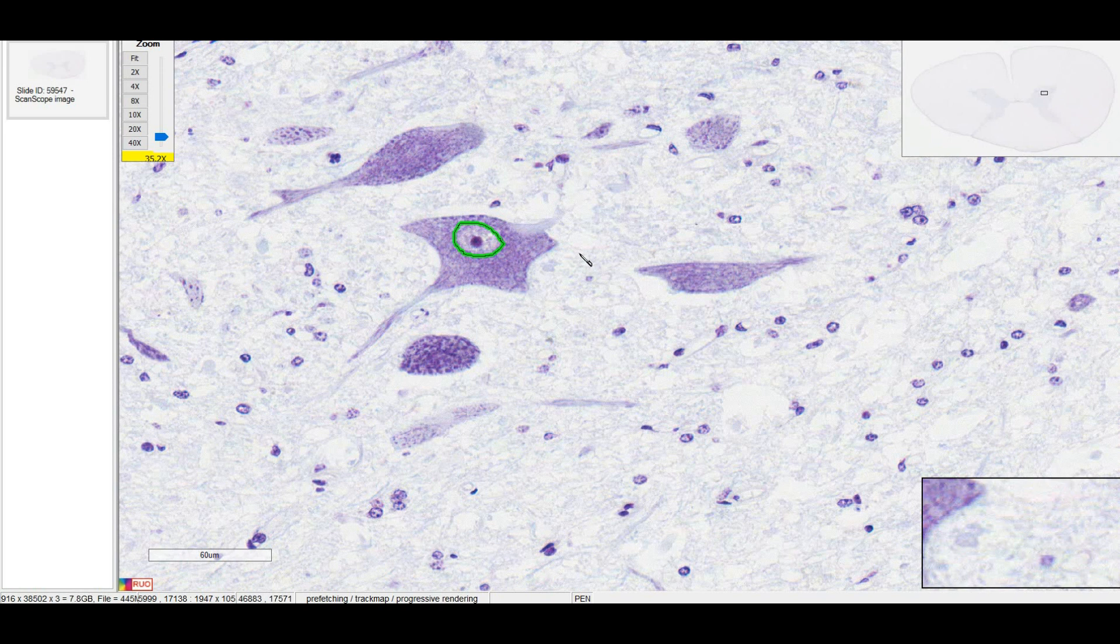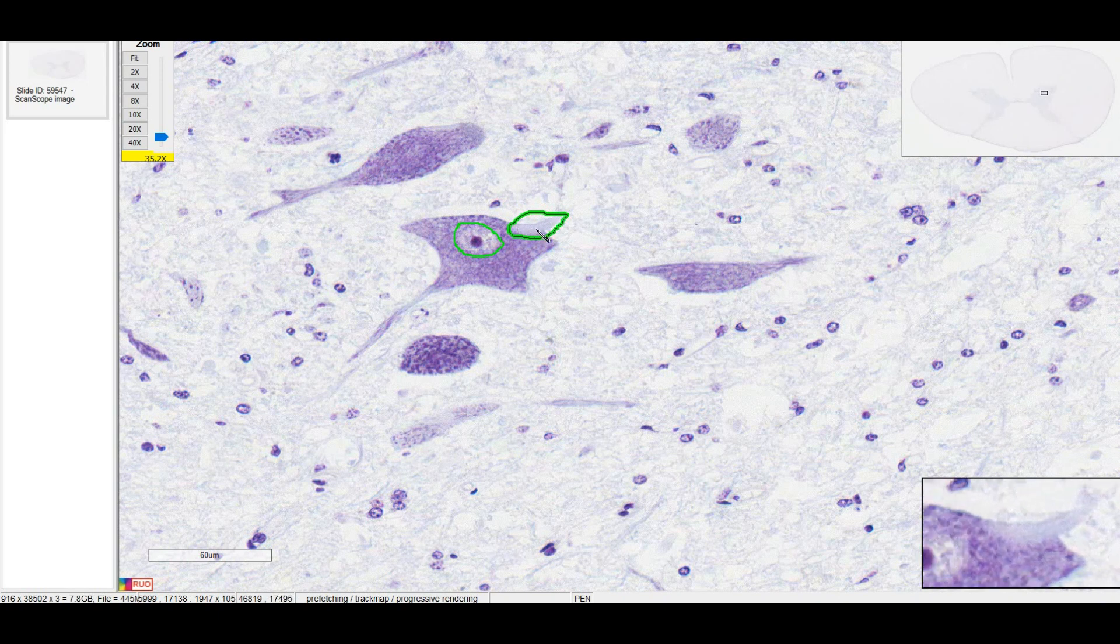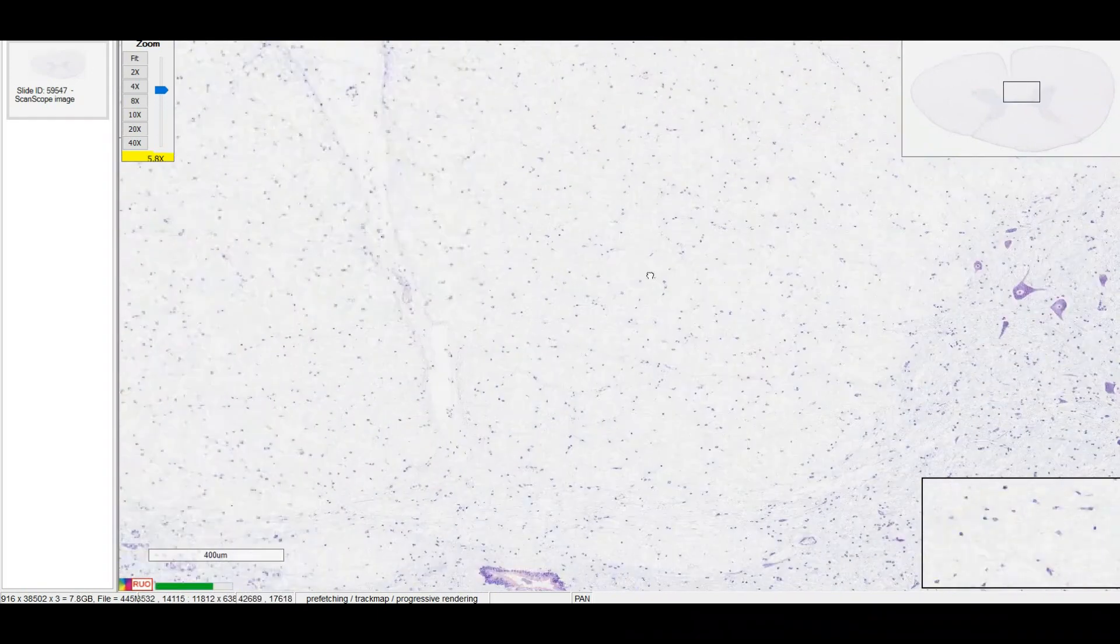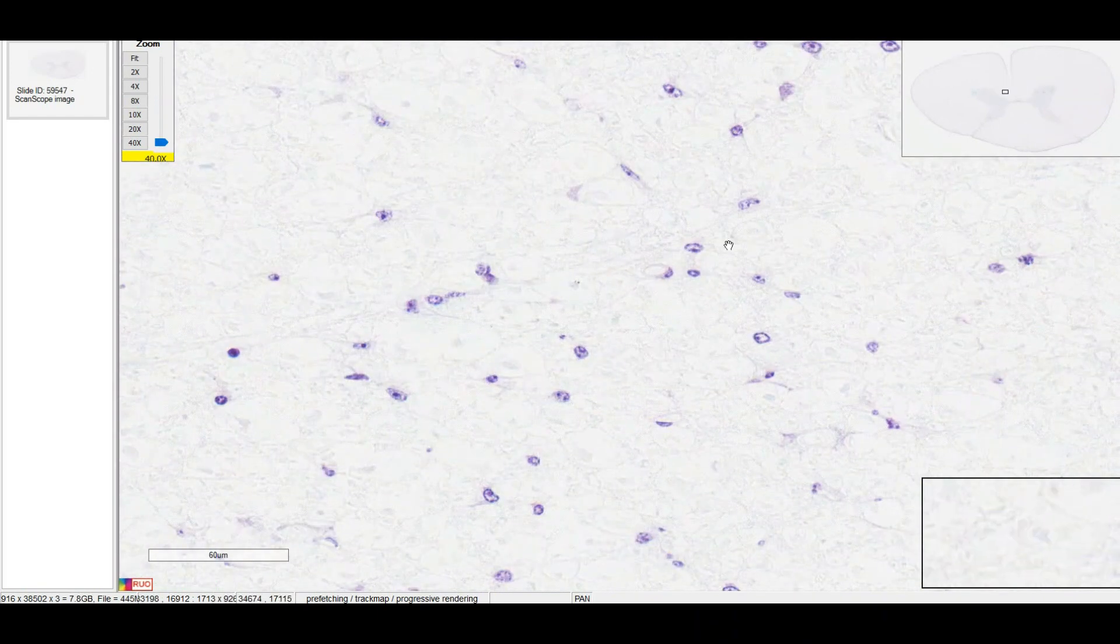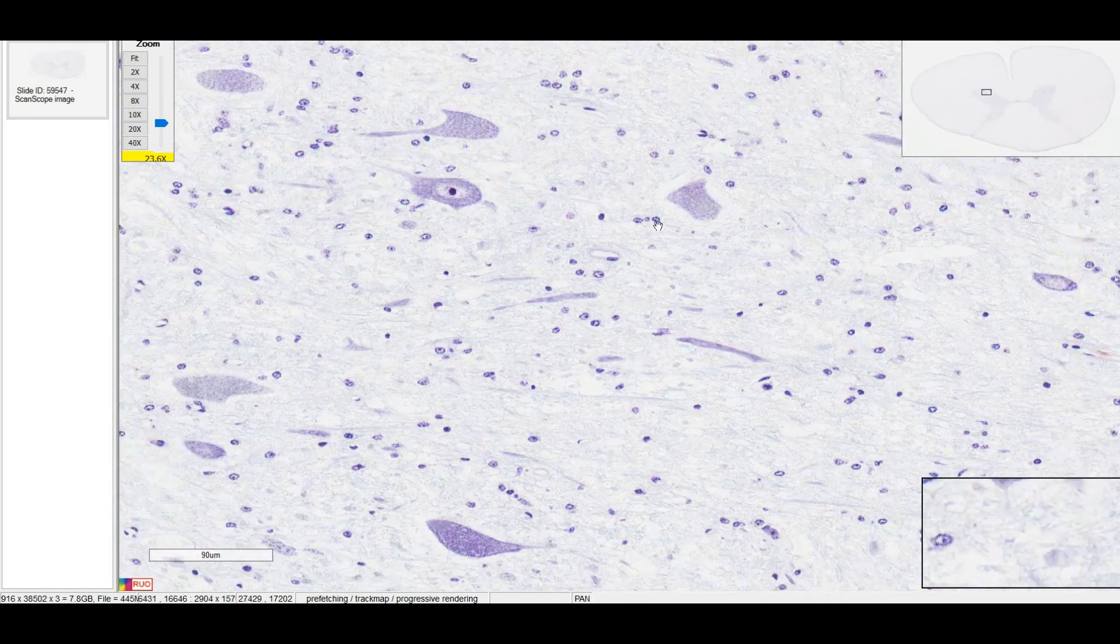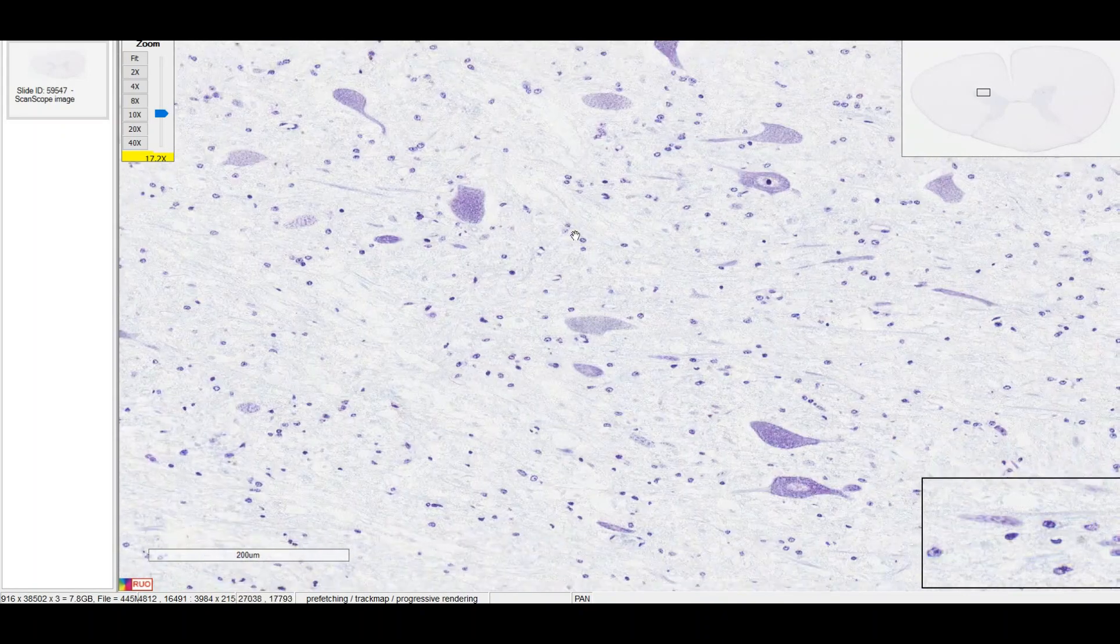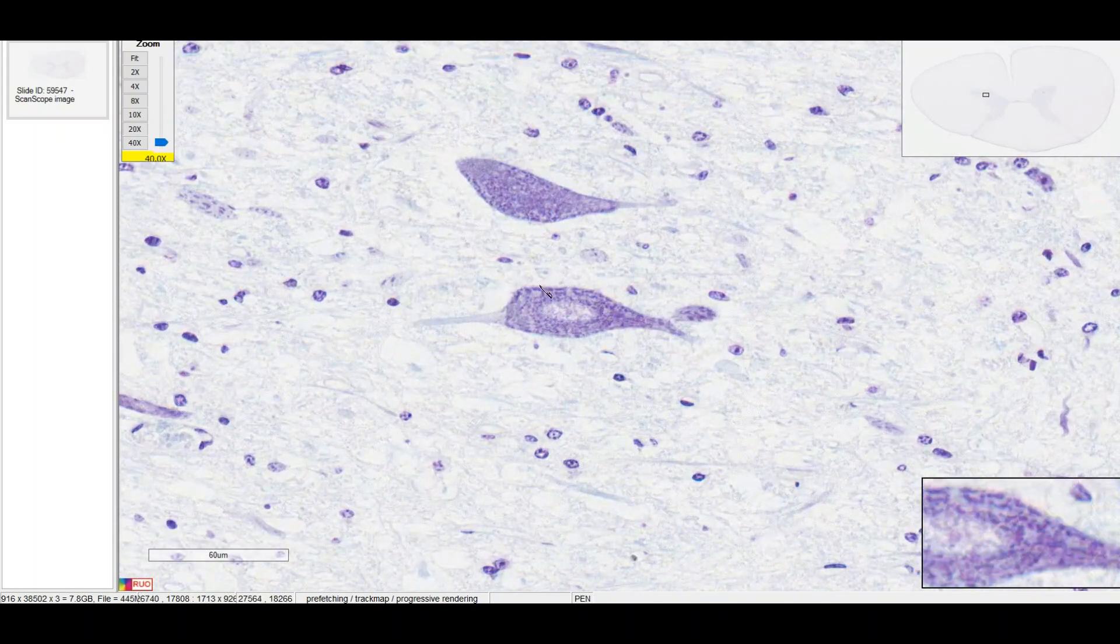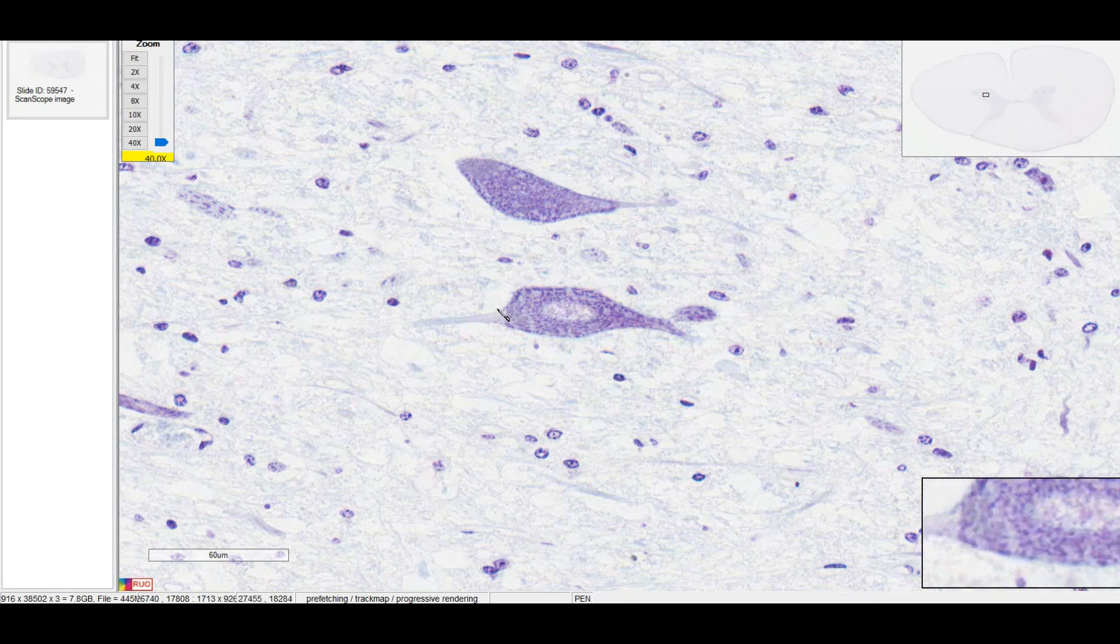The lab manual asks us to look for some axon hillocks. In order to find that, you're looking for an extension from the neural cell body that is absent of Nissel substance. And I believe I found another one on the other side. Looks like it's right here. Here's your neuronal cell body with the nucleus in the middle, and this looks like an axon hillock.